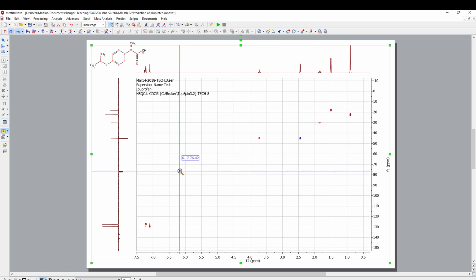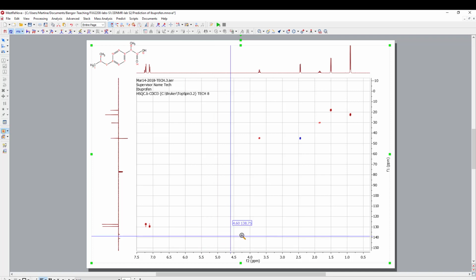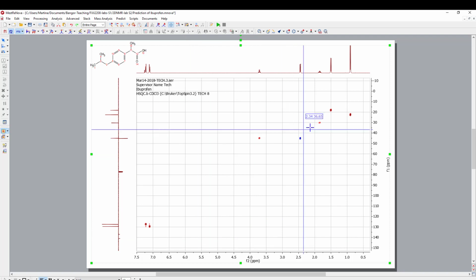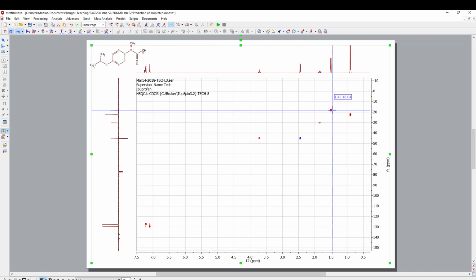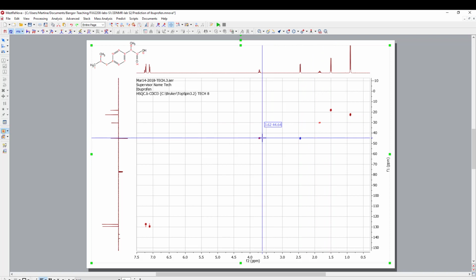What else can I see or can't see? Obviously, the quaternary atoms are not connected to any hydrogen atom. So this is why the spectrum is also cut off, because there is nothing here on the far end. So we don't see any cross peaks from the quaternary signals. So if you go along here, we can verify this one again by using the cross tool. So again, we can just go from one peak to another one to another one. This time we don't need the shift button.